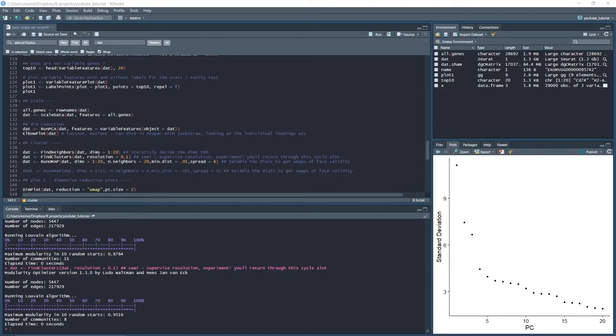clusters as well. So at this point I tend to use the same dimensionality reduction as I did in constructing the KNN graph. The 3 parameters that follow are all quite tweakable, and I'll show you an example of what happens if you change the number of neighbours and the spread and the distance and so on. So we'll run it first.